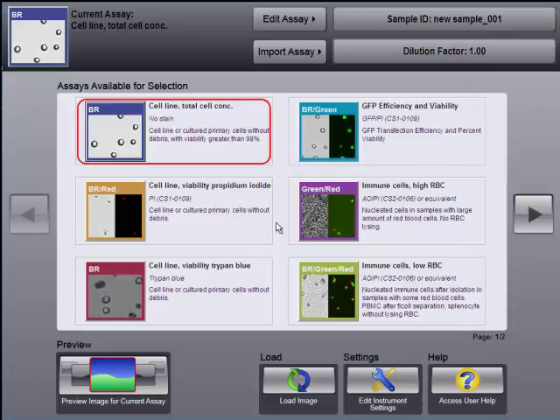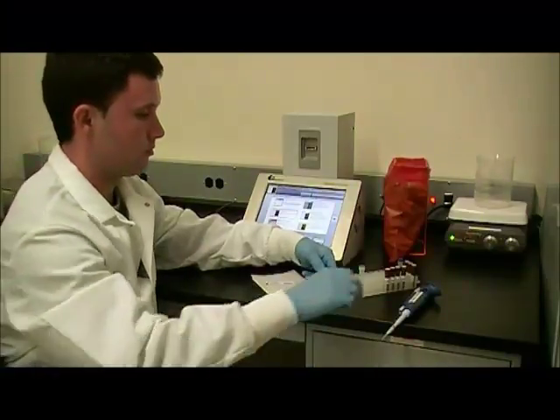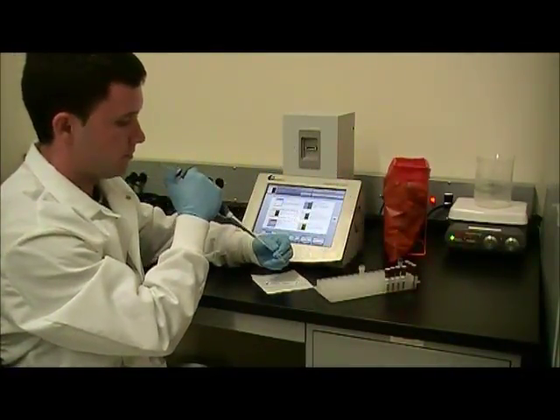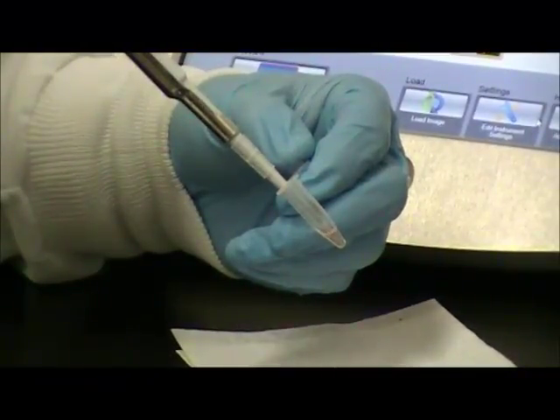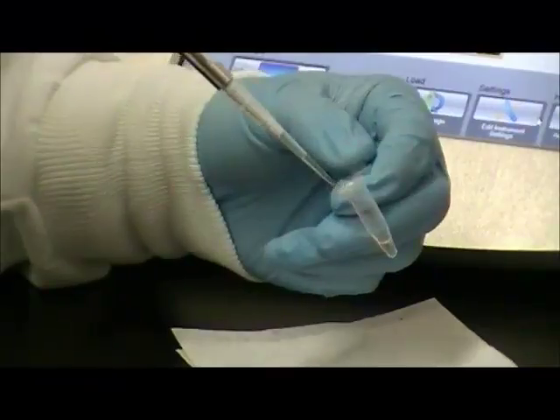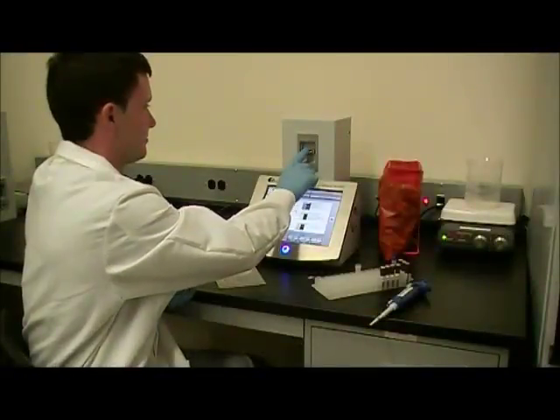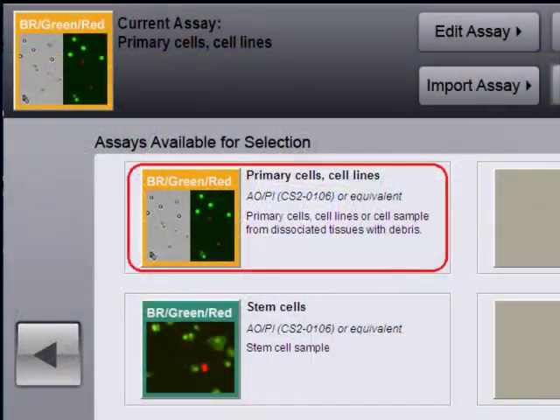Viability analysis can be performed with Trypan Blue or fluorescent dyes. In this example, acridine orange and propidium iodide are used to stain PBMCs. 20 microliters of stained sample is loaded into the Cellometer imaging chamber. The chamber is inserted into the Cellometer Auto2000 and the desired assay is selected.